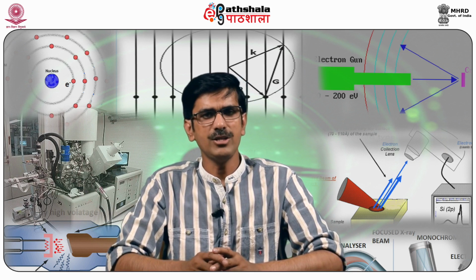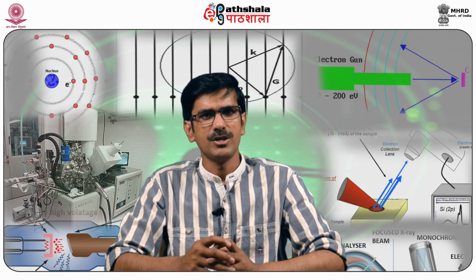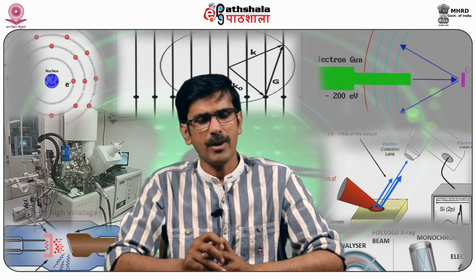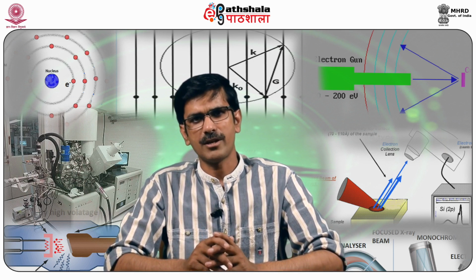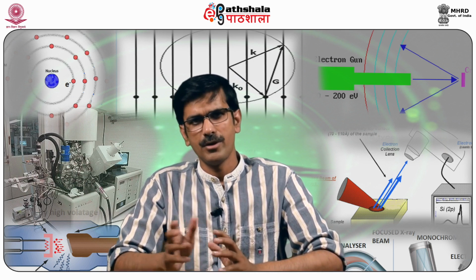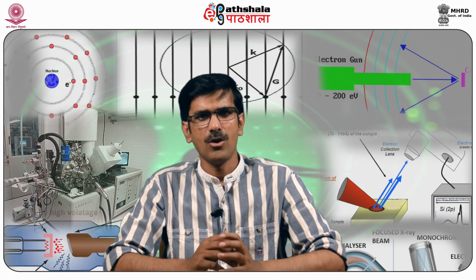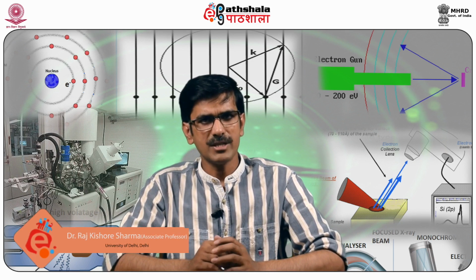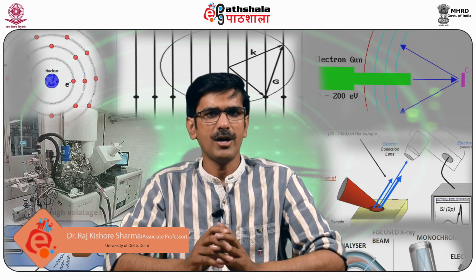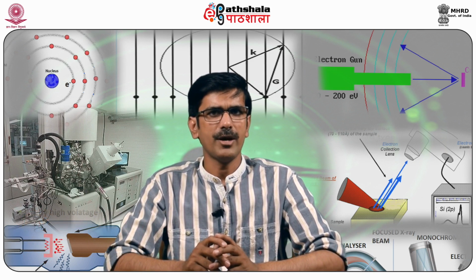EDX has been widely used in material science and nanotechnology and in several biological applications. Although it is not good for low atomic number samples like carbon, hydrogen, nitrogen, it is still widely used for biological applications as well. Although new analytical techniques have come into existence, EDX is firmly established as a standard microanalytical technique and will remain at the forefront of microanalysis.